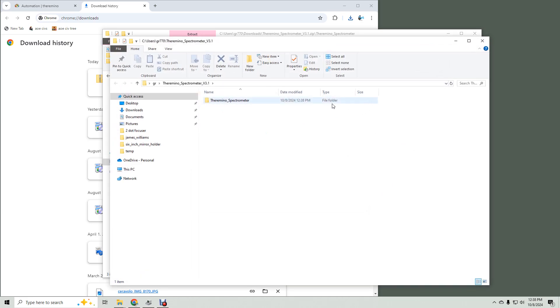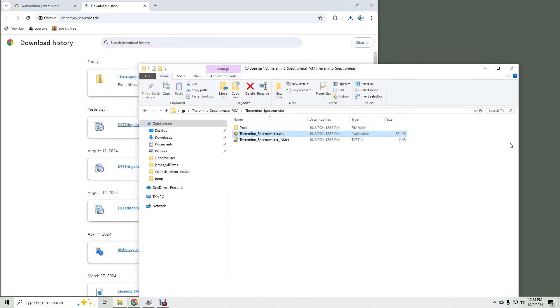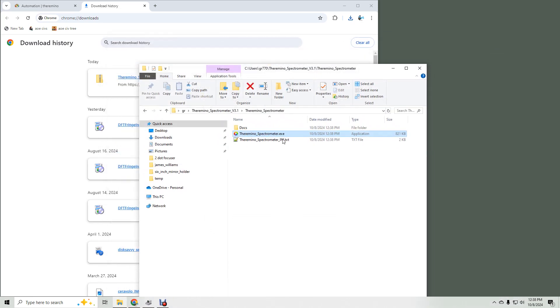Now double-click the folder — this is the application. You can double-click it to run it, but instead let's create a desktop shortcut first. Make sure you can see the desktop somewhere, so close or shrink windows. Drag the program to the desktop, but before you let go of the mouse, hold down the Alt key and you'll see it changes from 'move to desktop' to 'create link in desktop.' If you mess up and move it there, just drag it back and start over.